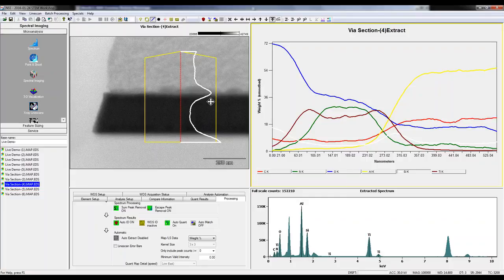and then if we plot the silicon, that's where we can see a very, very strong bump of the silicon right at the top of the titanium nitride layer. And so that confirms that this layer here is silicon rich. But it's not just silicon, because when we overlay the titanium, we can see that the titanium does extend into that region quite a bit. So that would indicate that we have a titanium silicide.